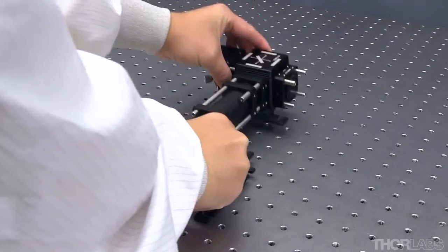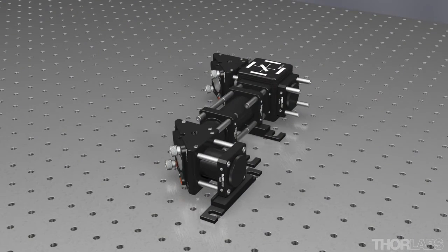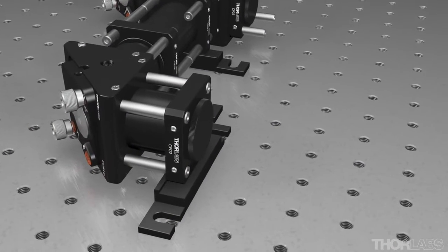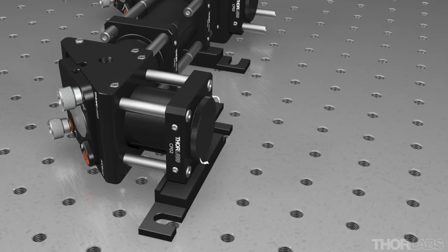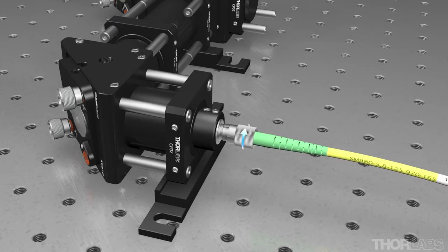Place the beam expander module on the table. Remove the end cap and install the collimator mount and fiber collimator. Connect the other end of the fiber patch cable to the beam expander section as shown here.